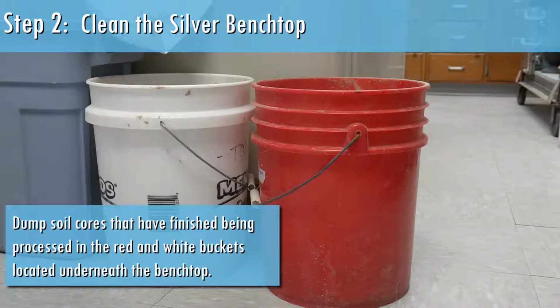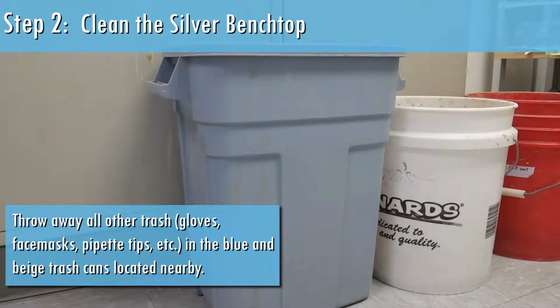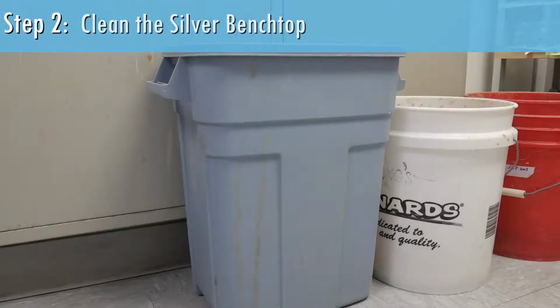Dump soil cores that have finished being processed in the red and white buckets located underneath the benchtop. Throw away all other trash, gloves, face masks, etc. into the blue and beige trash cans located nearby.